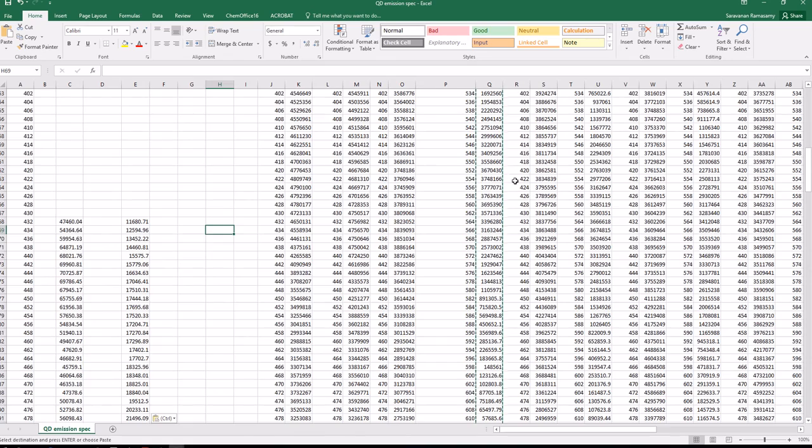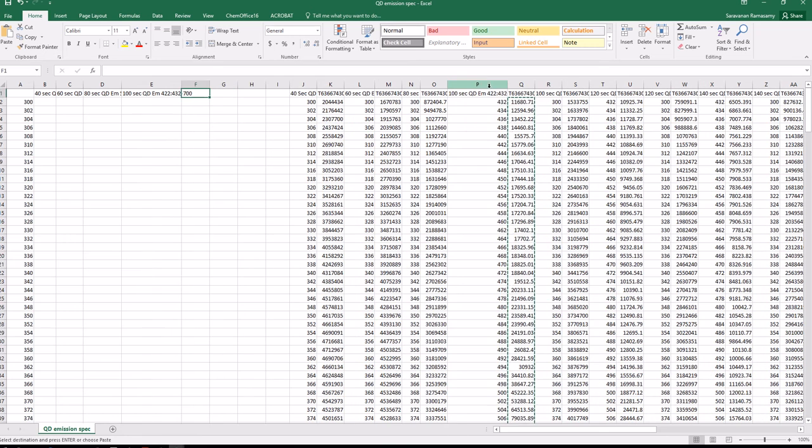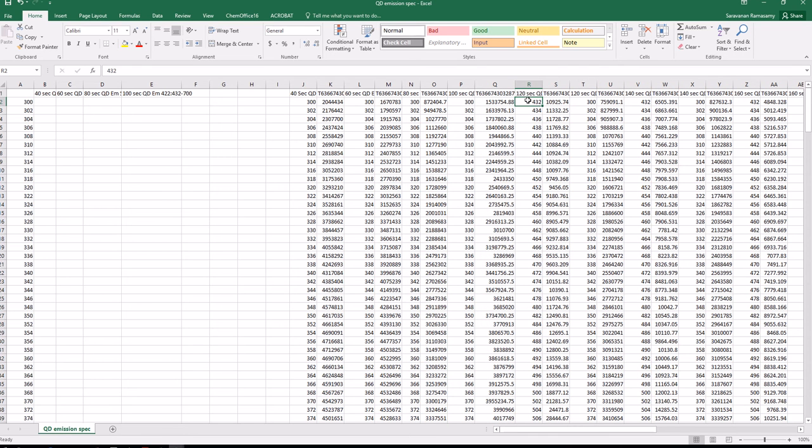Okay, there. That's 100 seconds sample. We're done with the 100-second emission, so let's delete that. Like that, you can copy paste 120, 140, 160, and 180.